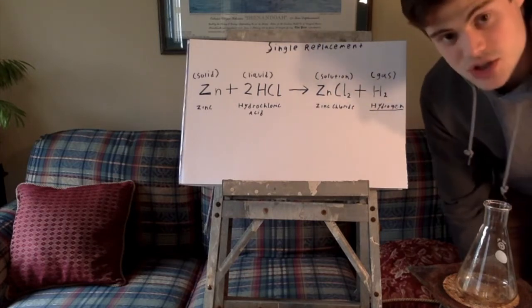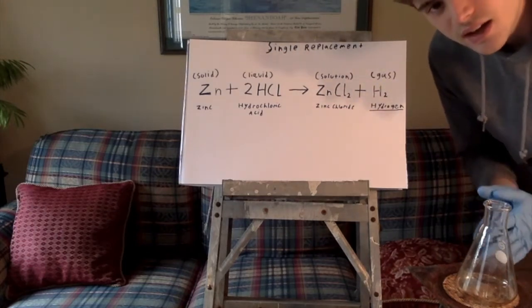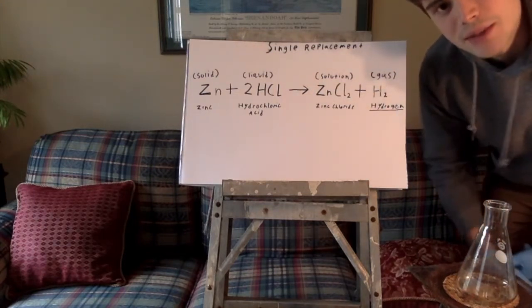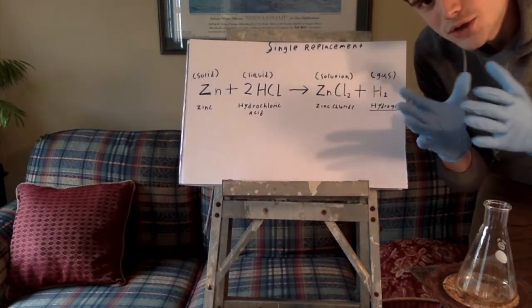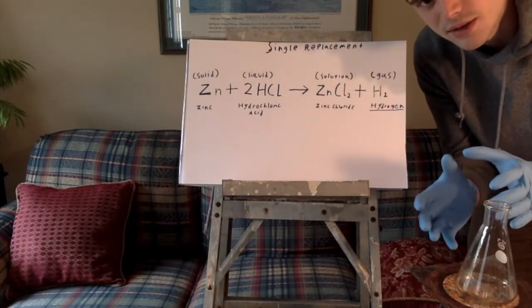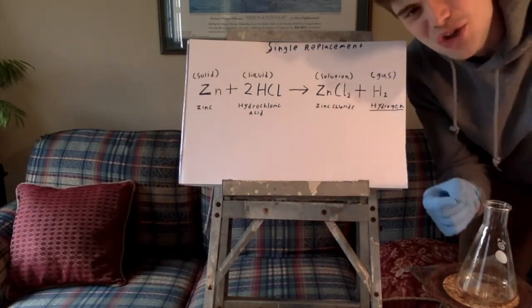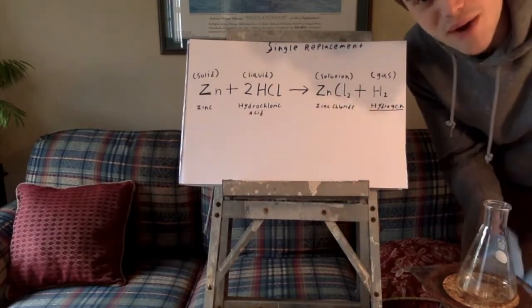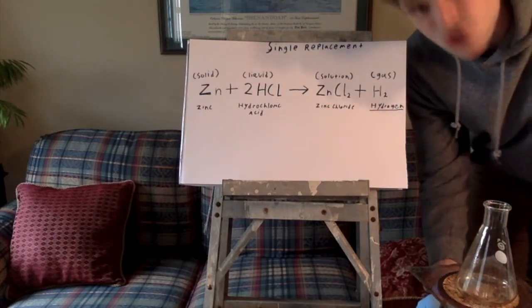So this kind of reaction that we're going to start with using hydrochloric acid and zinc is what we call a single replacement reaction. That means that when I take my zinc and my hydrochloric acid, certain elements between those two materials are actually going to change places. And we won't necessarily be able to see those very small molecules splitting up and rearranging themselves, but we are going to see really the result of those changes.